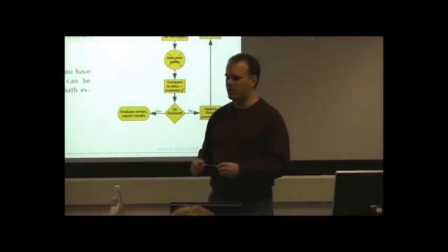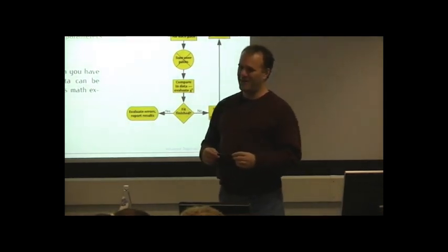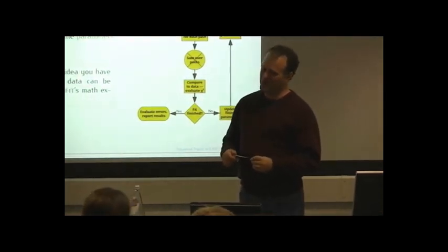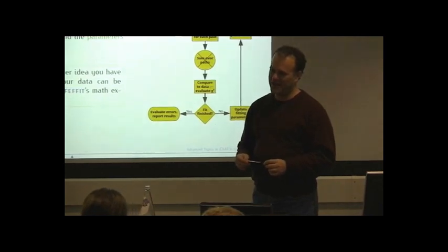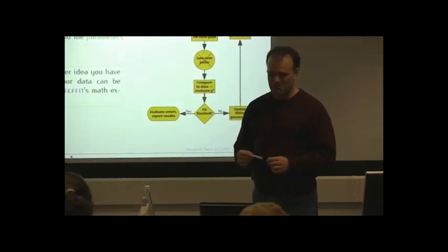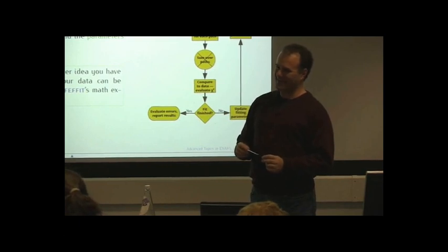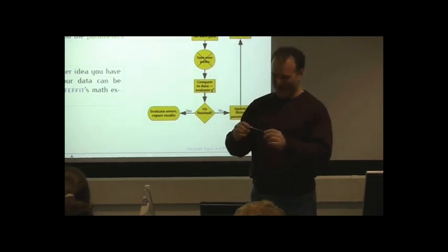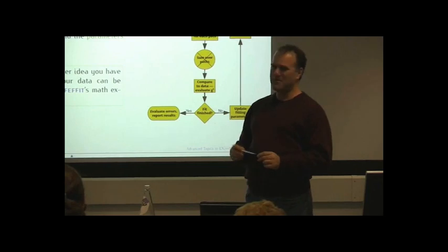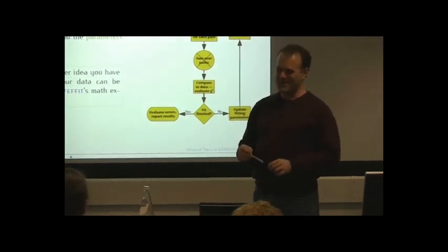My esteemed and thoroughly lovable thesis advisor wrote a paper that suggested that in the context of XAFS it should be +2. In virtually no other ways do I ever disagree with Ed, but I don't agree with him on that. So I think Ed is mistaken, but I'm also just not a big enough guy to really get up and say, no, Ed is wrong, don't listen to Ed. He's more important than I am.